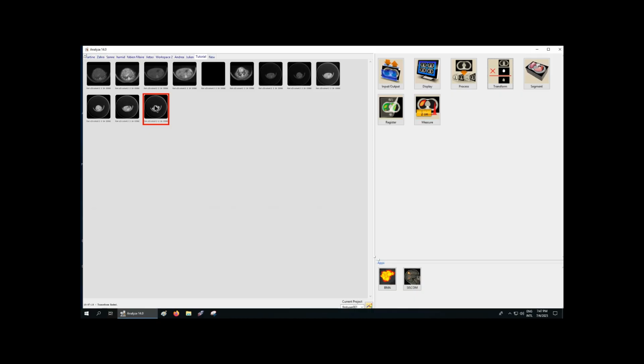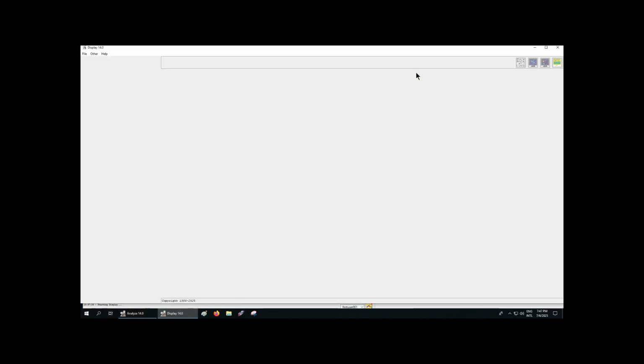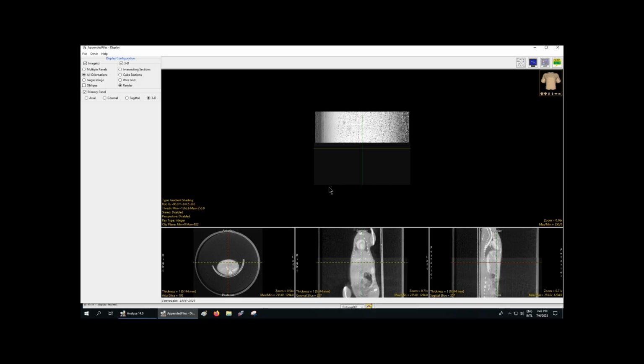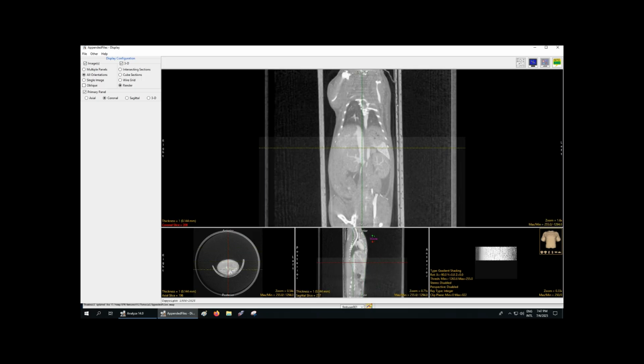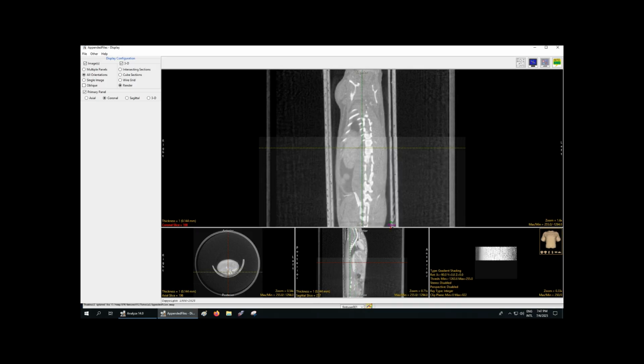There we go. And now what we can do is we can select both of these together, right mouse click, and then choose append. Don't unload. Unloading means that you delete these from your workspace, and I very much don't want to do that. Just for progress sake, click on append, and then there we go. They are perfectly merged together. With perfect overlap.